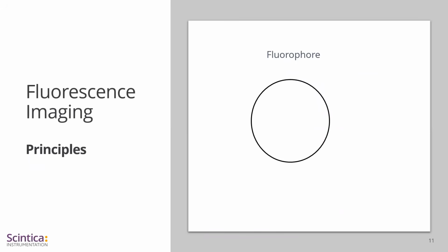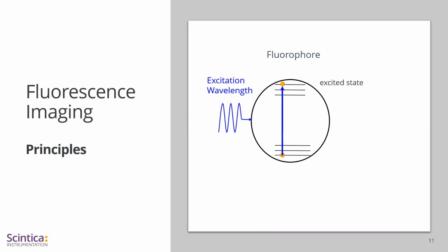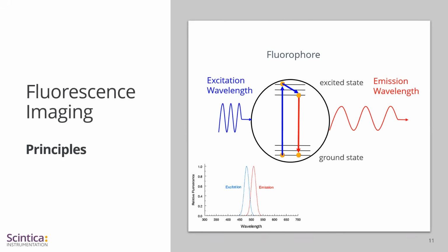The way that this excitation emission works is through the absorption of the light by the fluorophore. The incoming light or excitation wavelength needs to correspond to the right amount of energy in order to excite electrons in a specific fluorophore. These excited electrons will end up at a higher energy state as they absorb this light, and as they're trying to return back to their ground state, will lose some of that energy to heat. As a consequence, the light that these electrons emit upon return to ground state will be one of a lower energy and thus longer wavelength. Note in the light spectrum here that there's a right shift from blue to red between excitation and emission spectra.